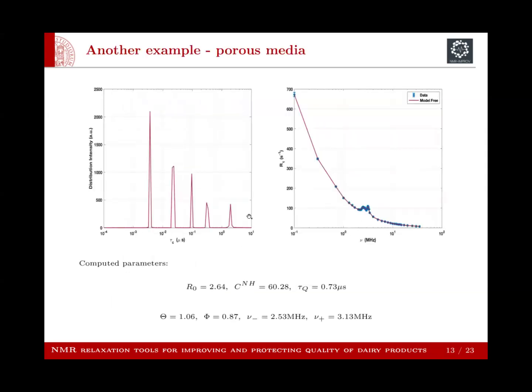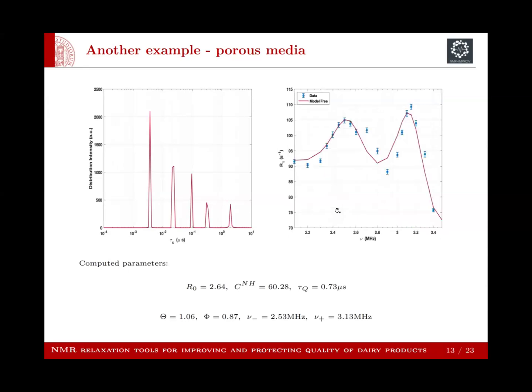And this is another example for a porous media. Also in this case, the software works very well, as you can see also from this zoom of the part of the quadrupolar effect.